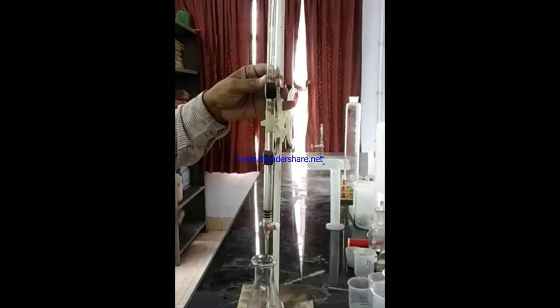We will multiply it by 1000 to give the value in mg per liter. Then we will divide it by the volume of sample taken, say 150 ml or 100 ml taken for titration. Okay, that will give us the initial DO level.